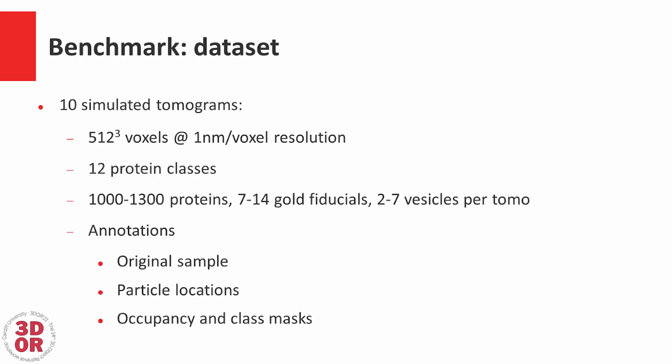We generated 10 tomograms with 12 different protein classes, gold fiducials and vesicles. For 9 of them, we provided ground truth annotations, such as class masks, particle locations, and the original sample that was imaged. There is detailed information about how exactly we generated the dataset in the paper. I think it is also worth noting that we hope this dataset can be useful for other cryo-ET method development, and not only classification and localization, but also reconstruction.